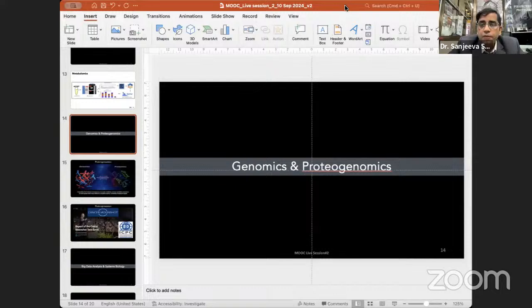Now TMT will be very powerful, because TMT is very accurate for quantification. If you have done this kind of sample processing and fractionation, then TMT-based approaches will be able to do more accurate quantification of the low abundant protein, which you were not able to do earlier. But your sample preparation and fractionation strategies will play a very important role in giving you broad coverage. We'll be happy to take more questions, so please feel free to ask on the forum.